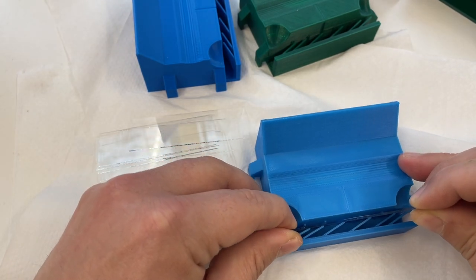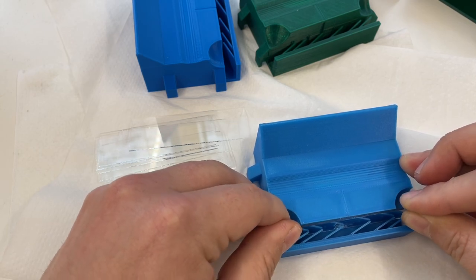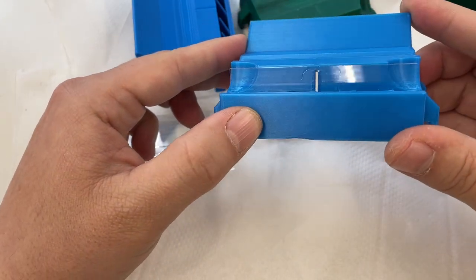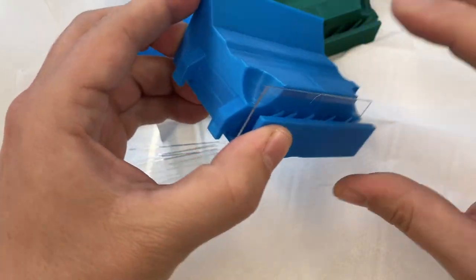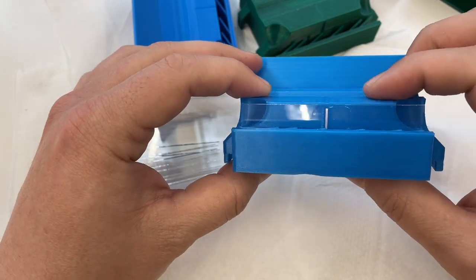Then you just press the slide inside the device. Align the silicone oil with the slit. You can see it here. And practically that's it. As simple as it sounds.